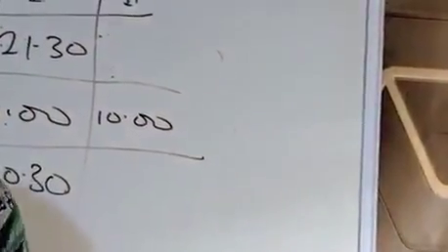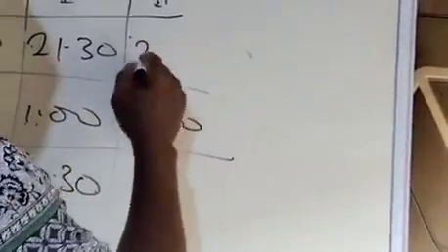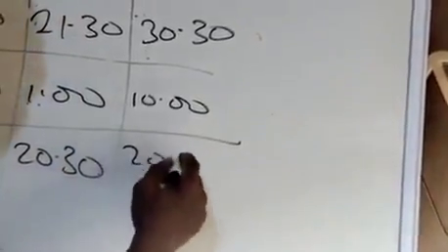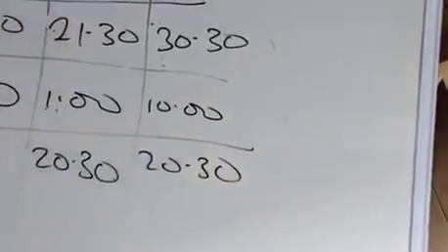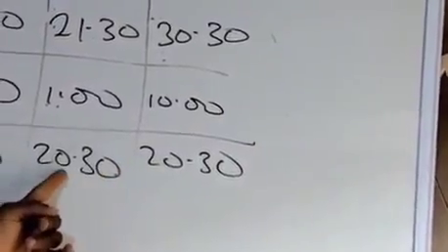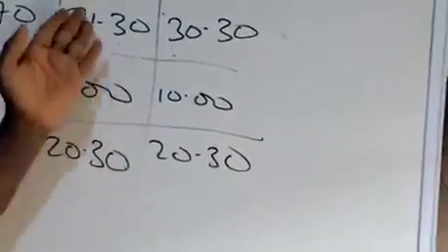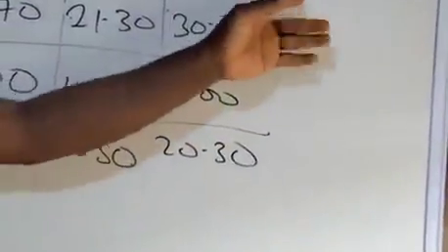30.30. So report our work here. We have 30.30. When we subtract, we have 20.30. So you see that these two readings are consistent, they're very accurate. So I don't need to do the third one. That would be a waste of time in the exam hall. Whether you do 2 or you do 3 times after the rough, you get the same mark.